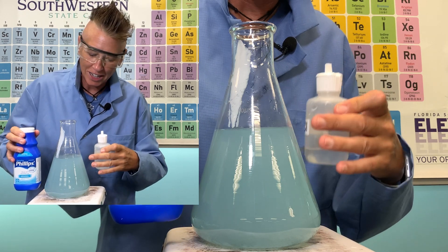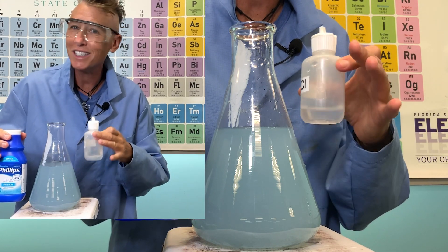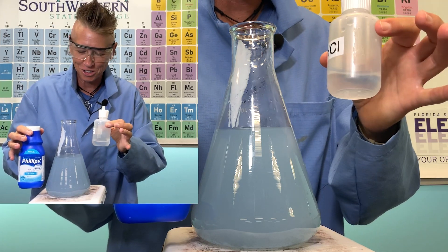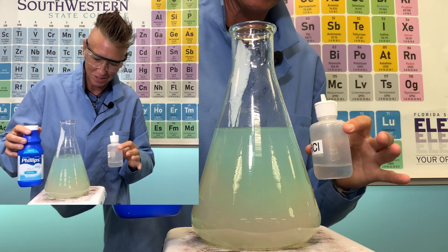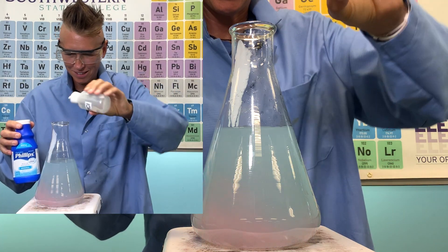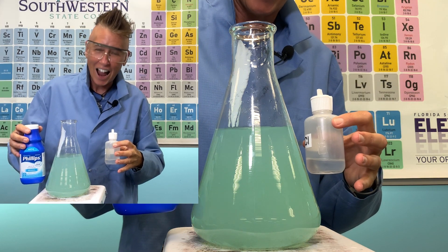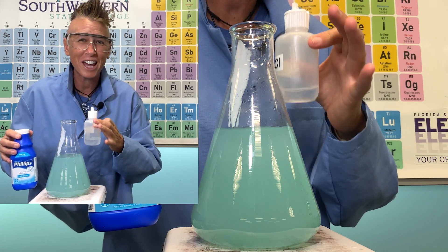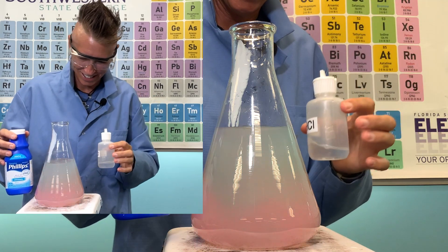Right now with the acid-base indicator in there, it is still slightly basic — I didn't hit the point of neutralization. I'm going to add more of my hydrochloric acid. Do you see how it turns acidic but then goes back to a different color? That's because the magnesium hydroxide dissolved in water is interacting with my stomach acid. The hydrochloric acid is also turning the magnesium hydroxide more soluble, so more magnesium hydroxide is going into solution.